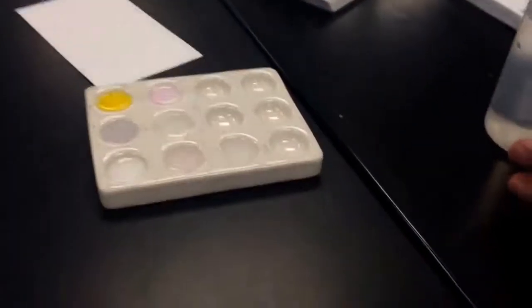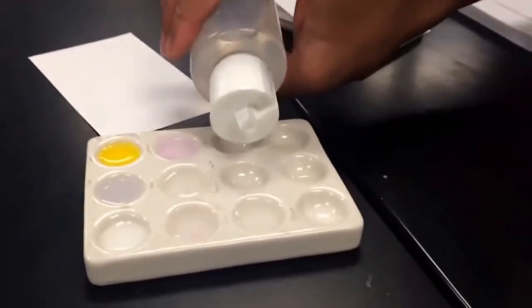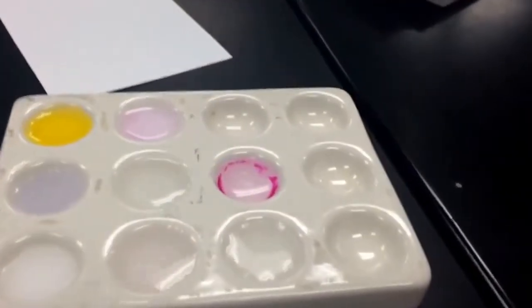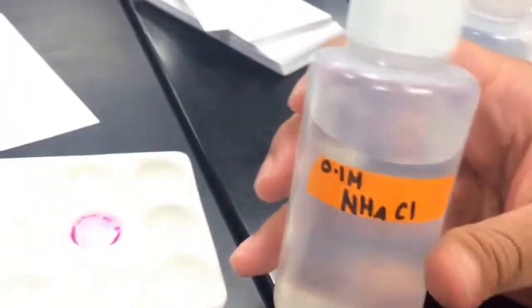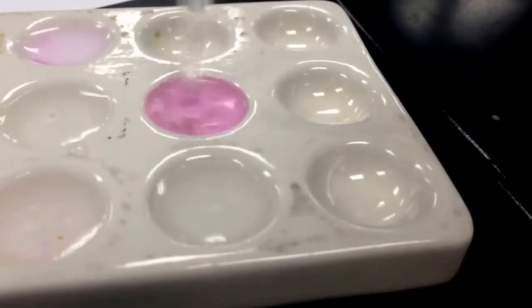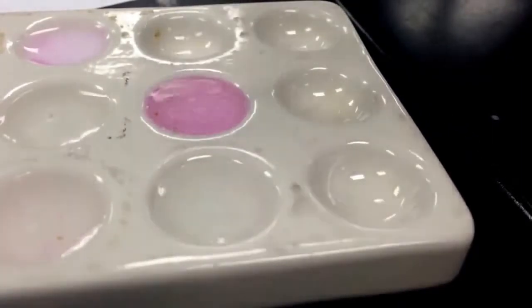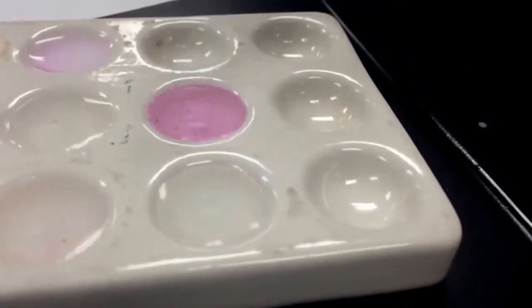Number 8 is sodium hydroxide. Here you go. And that is purple, however, that is not from our chemical, that is just previous residue. Here's ammonium chloride. And you'll see when we mix this, the purple disappears. Usually. See, it gets a different tint. And we do not see any precipitate. Just purple from the residue.